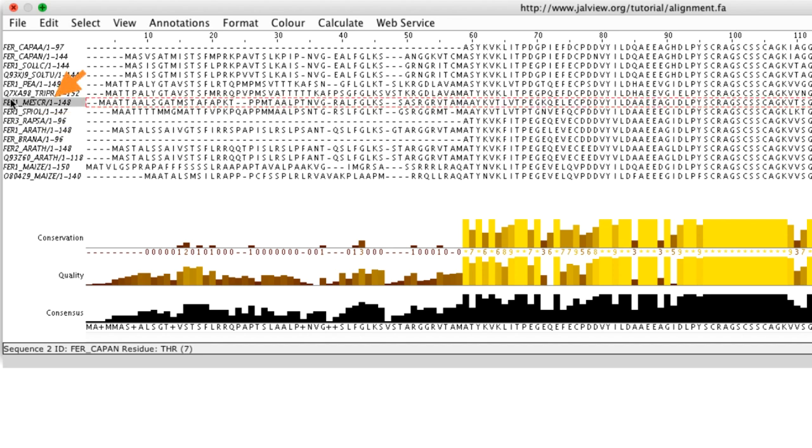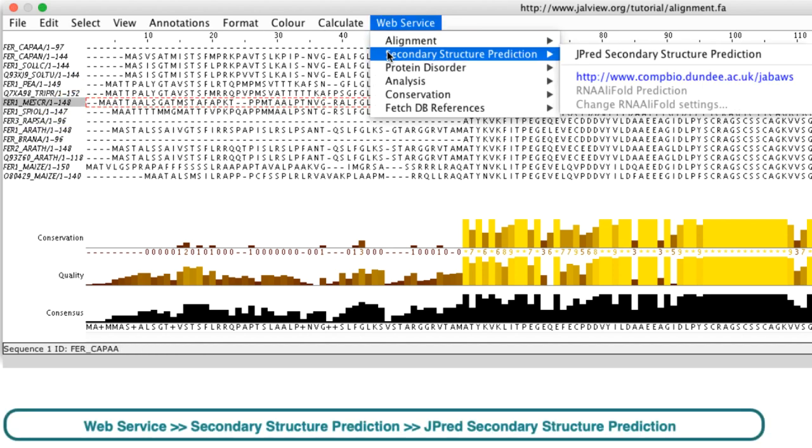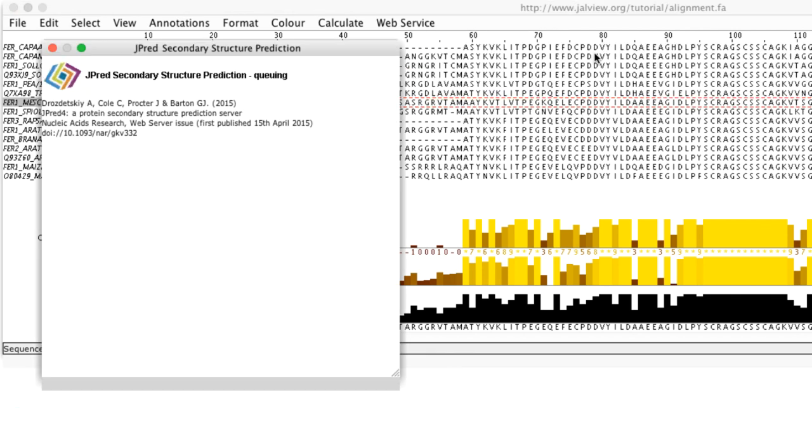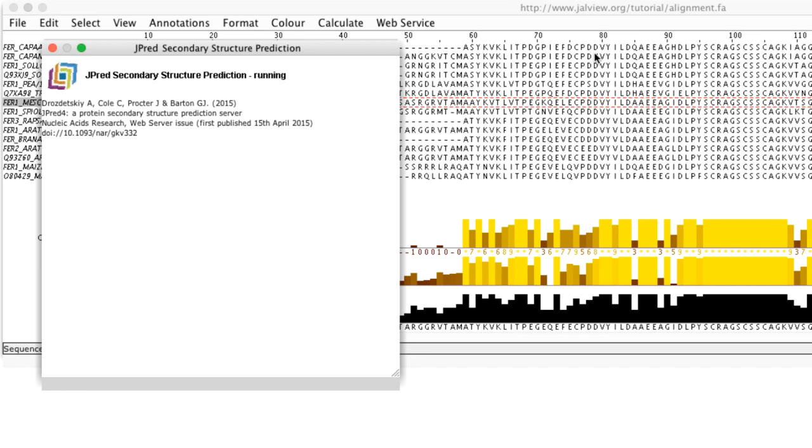If a specific sequence is selected when JPRED is launched, a forward JPRED prediction is executed. This involves a PSI-BLAST sequence database search and an alignment profile generated to find similar sequences. JPRED then uses the PSI-BLAST alignment profile to perform the Secondary Structure Prediction. A Status window opens reporting the progress of a job. It can take several minutes.